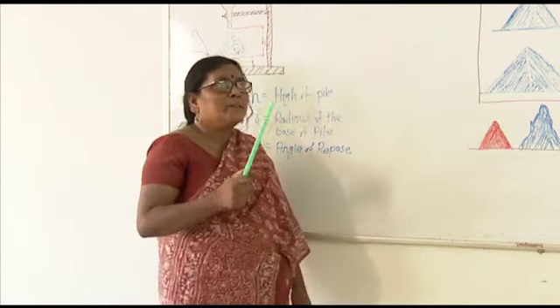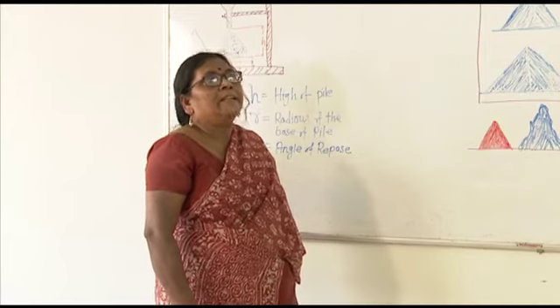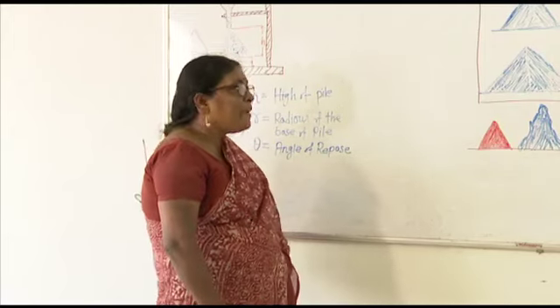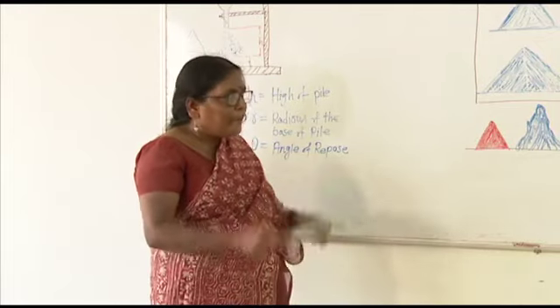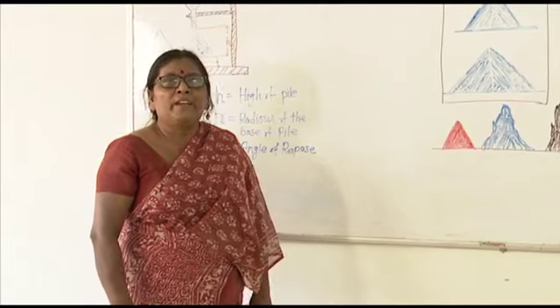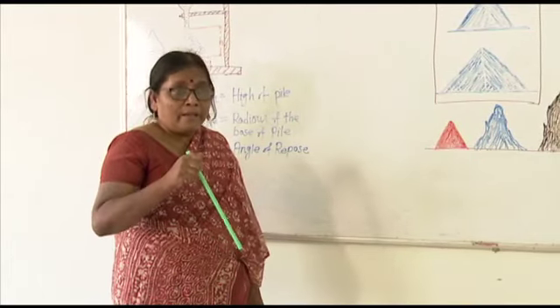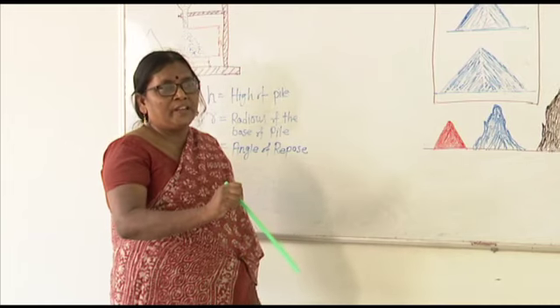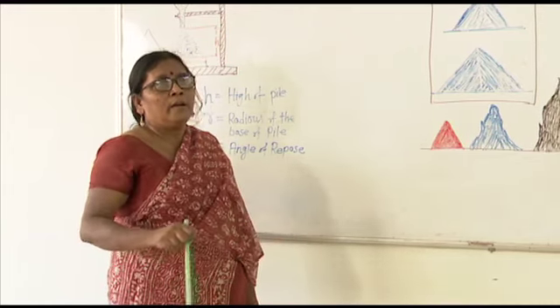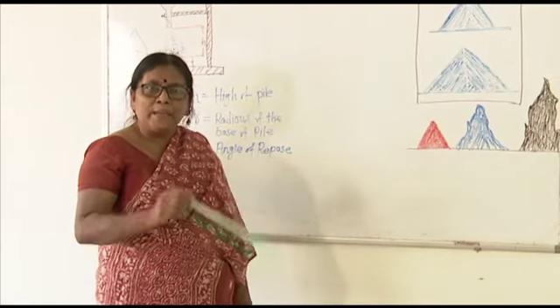The value of the angle of repose indicates whether the particle will be free flowing or not. A free flowing particle will give smaller angles, somewhere around 20-25 degrees; the lesser the better. If a particle has high friction, it won't flow evenly, and that will give us bigger angles.